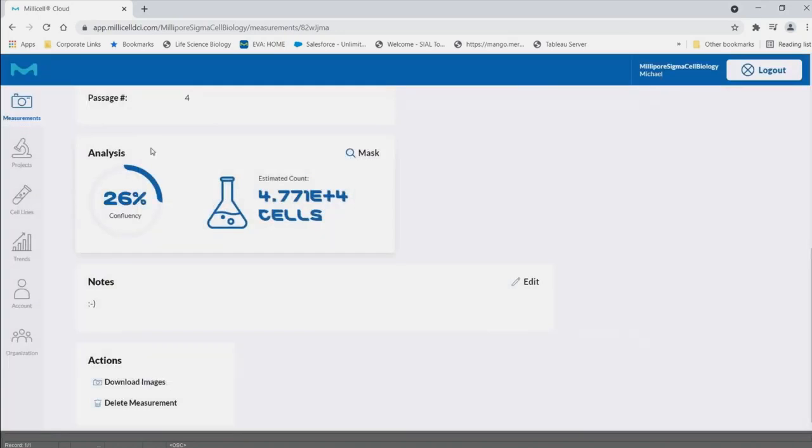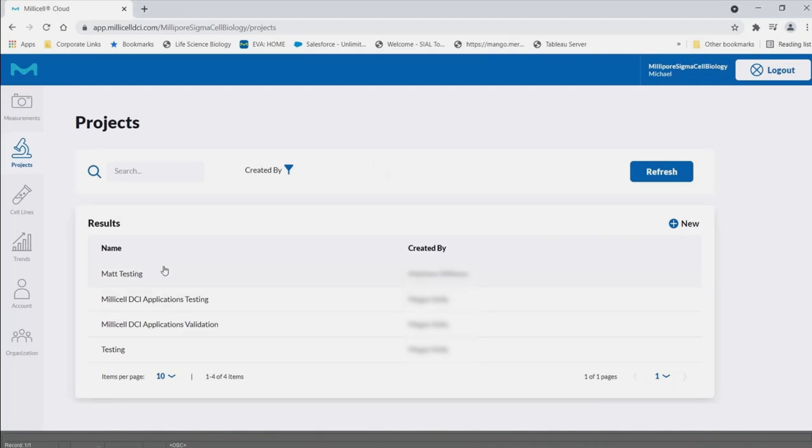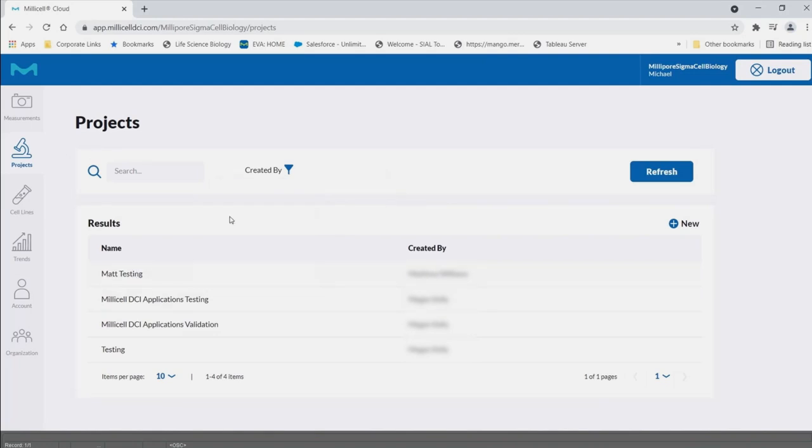Project tabs. Here, all projects can be searched according to the project name or creator.